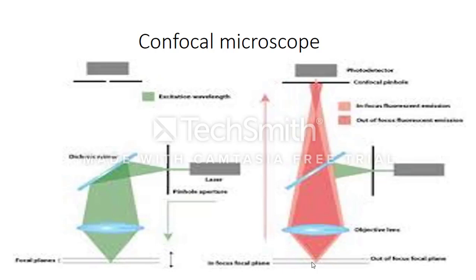Now you may know that cells are three-dimensional, and there are certain planes that we can look at the cell from. The best way to get good images of a cell is to differentiate the planes and look at each plane individually, and we can see which plane gives the best representation of the cell.